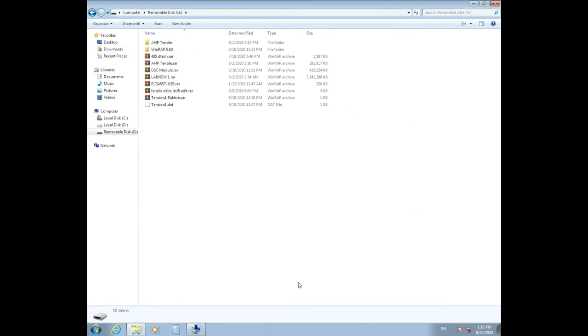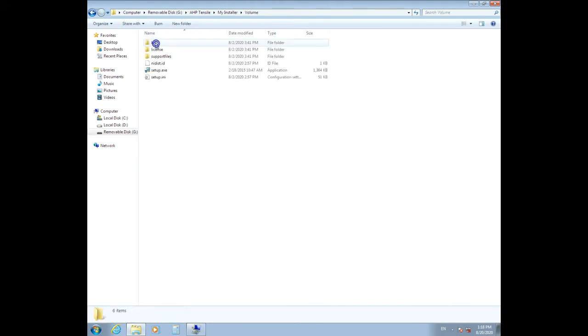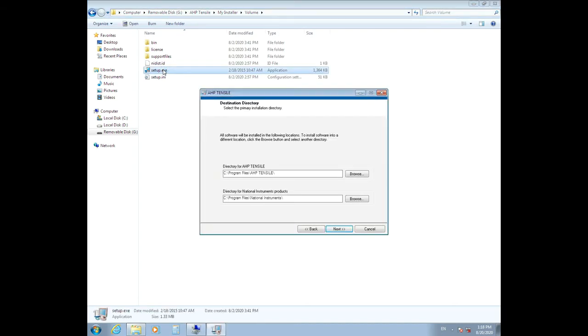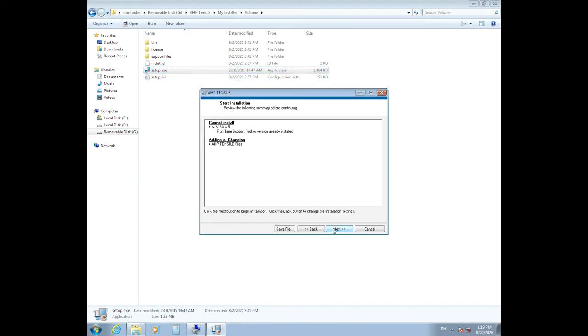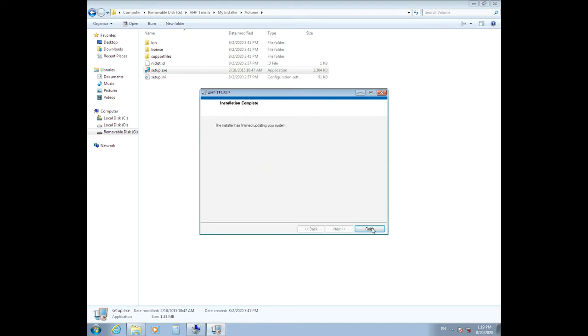Go back to your USB flash, click on the AHP Tensile folder, choose the installer, then double-click on Volume and set it up. Install the software easily by clicking the Next buttons and then Finish.